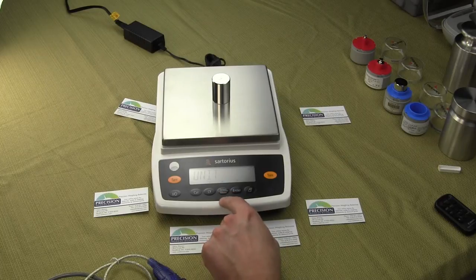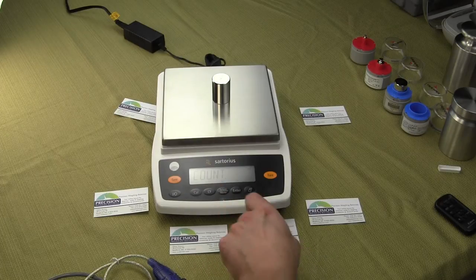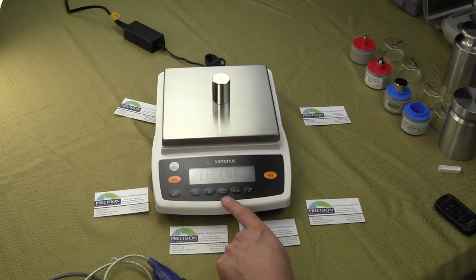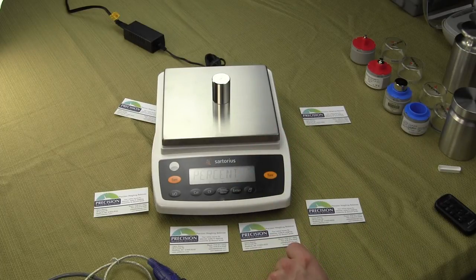If we press the Menu Select to go down again, you'll see there's the Count application. In the Count application, you can configure the balance for a reference sample of 1 to 100 if you wanted to use this for parts counting or small parts. The next application is Percent. Percent allows you to obtain the weight reading in percent in proportion to a reference weight. This is typically used for formulation — a lot of ink mixes are used in a Pantone color chart. They typically mix one pound of ink at a time, set that on the balance in Percent mode, set that to 100%, take the weight off, and then they're able to do their formulation.